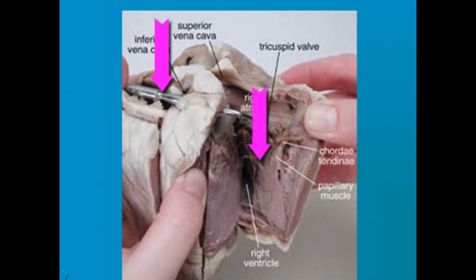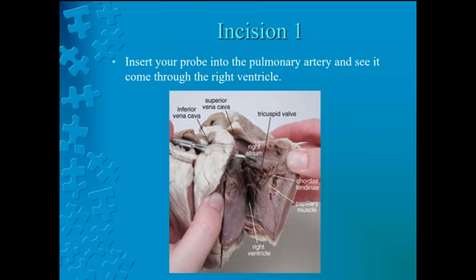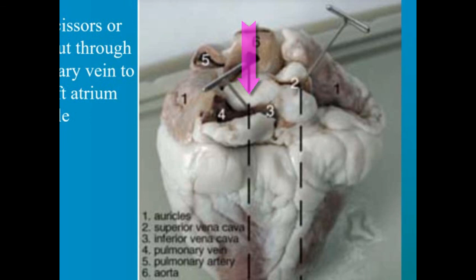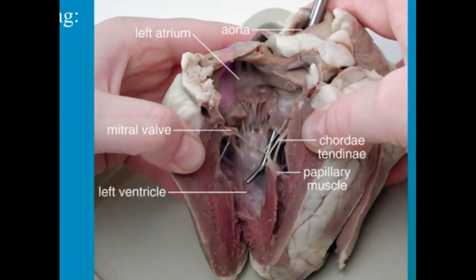You will make an incision through the pulmonary vein to open the left atrium and ventricle. We will pause to make the second incision. Locate the mitral valve, or the bicuspid valve, between the left atrium and ventricle. This will have two flaps of membrane connected to papillary muscles by the chordae tendineae, just like the tricuspid valve. The mitral valve is the other atrioventricular valve that prevents blood from flowing back into the atrium from the ventricle. You should also locate the chordae tendineae, papillary muscle, and the left ventricle. We will pause to locate these parts of the heart.